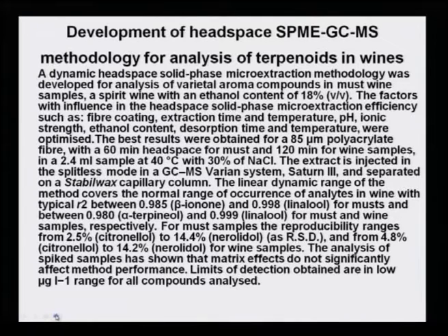The factors which influence the headspace solid phase micro extraction efficiency are the fiber coating, extraction time and temperature, pH, ionic strength, ethanolic content, desorption time and temperature. These parameters were all optimized. You see, there are so many parameters. What is the fiber coating? What is the extraction time that is required? What is the temperature at which it is to be done?